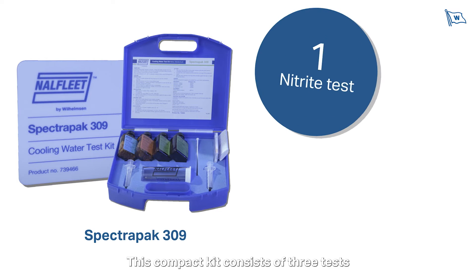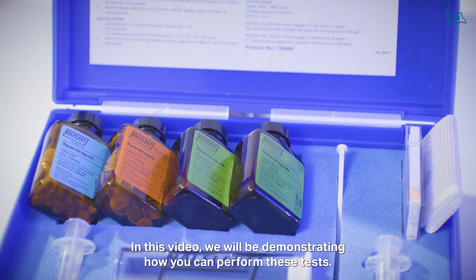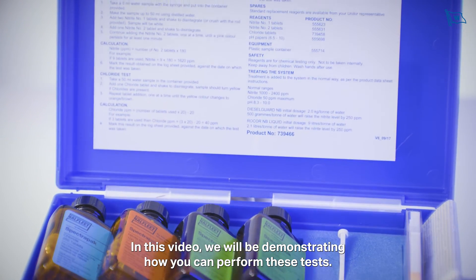This compact kit consists of three tests: the nitrite test, chloride test, and pH test. In this video we'll be demonstrating how you can perform these tests.